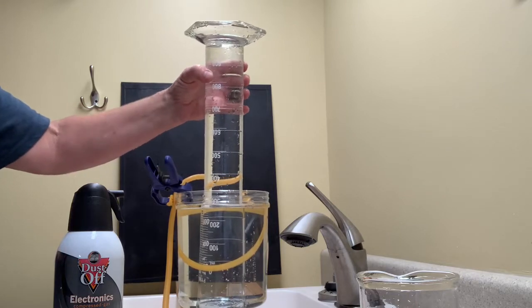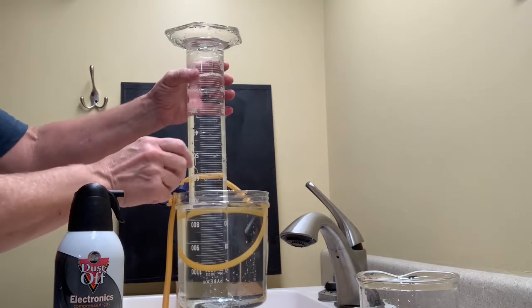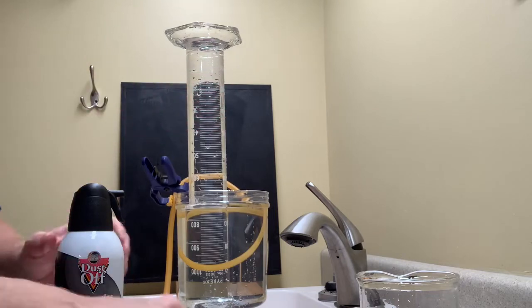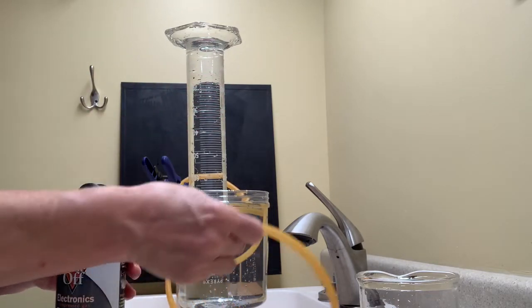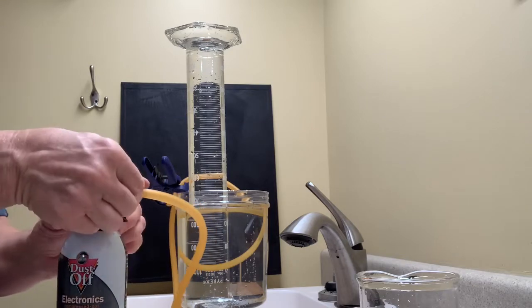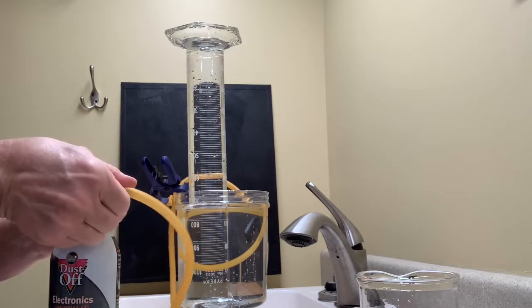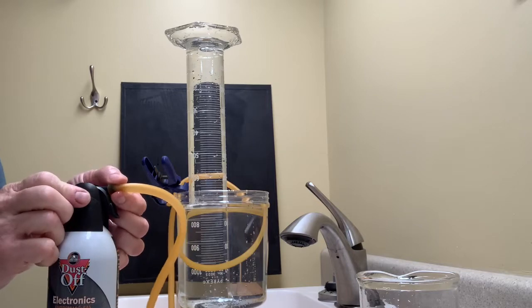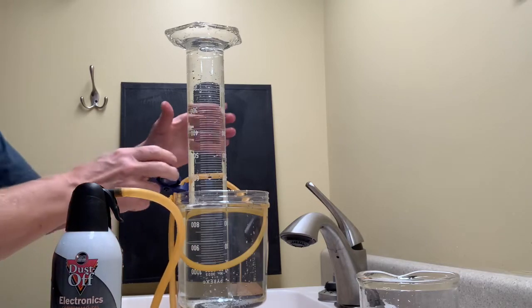And now I'll hook the hose. There, get that cylinder steady. Hook the hose on to the dust off canister. And then submerge the hose up underneath the graduated cylinder.